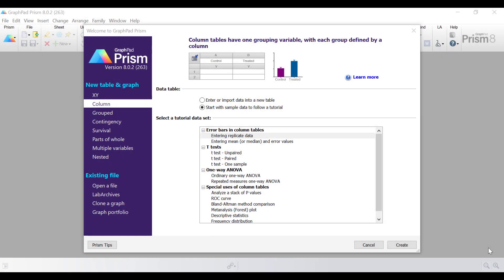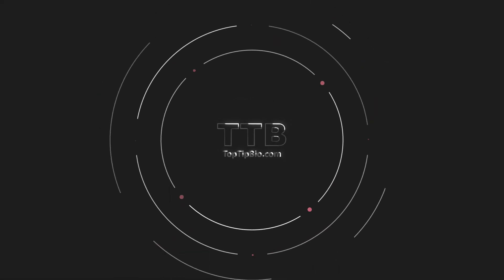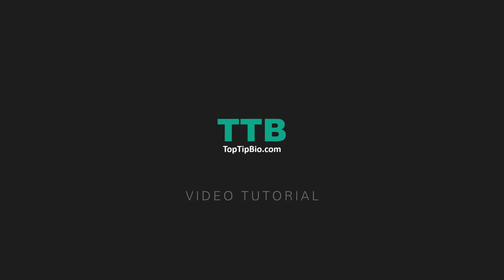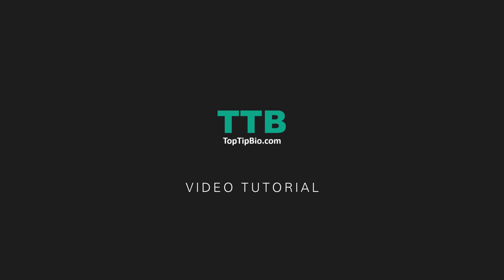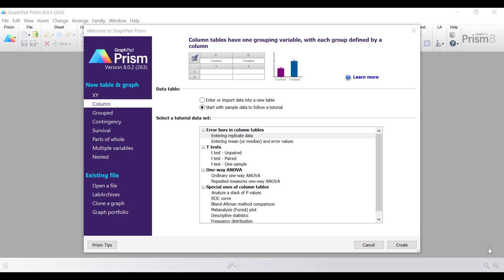In this video I'm going to show you how to obtain descriptive statistics by using GraphPad Prism. Obtaining descriptive statistics using GraphPad Prism is relatively straightforward.